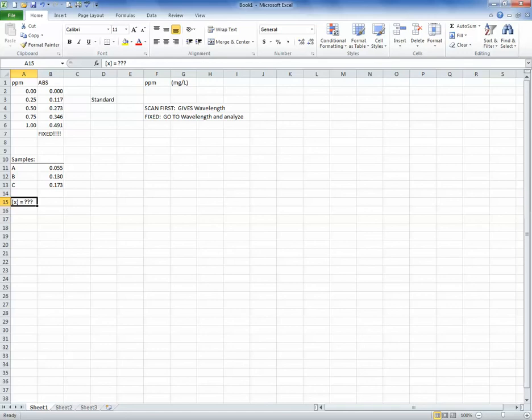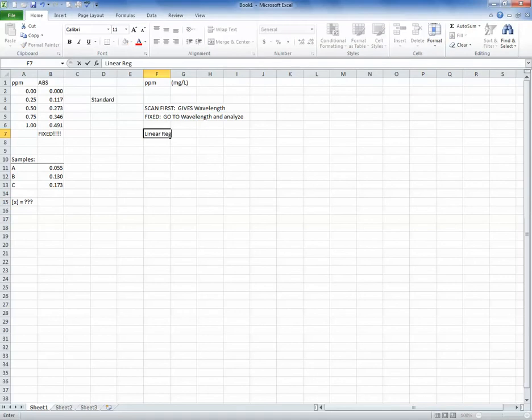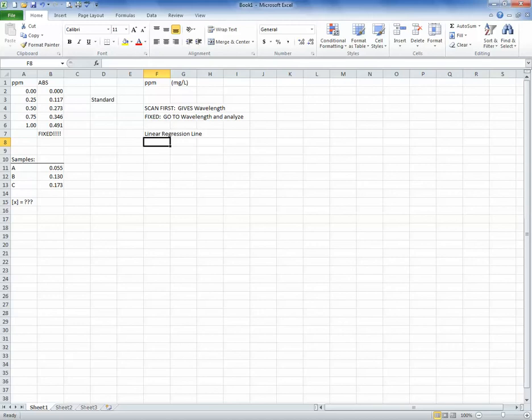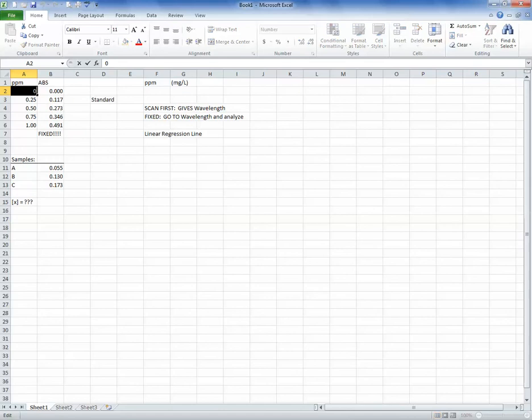So now that I've got my data into the spreadsheet, the first thing that I have to do is make what we call a linear regression line. A linear regression line is very easy to do in Excel. Mathematicians make it more difficult than what it's supposed to be. They'll make you go through these horrible, horrendous equations to do a manual linear regression line. Why do it manually when we've got the technology to do it for us? Don't tell a mathematician that, though.